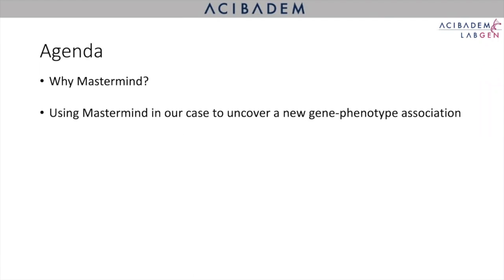In this presentation, first I will talk about why we use Mastermind, and then I will walk you through a case which we use Mastermind to rapidly uncover a new gene phenotype association that has not been listed on common disease databases yet.